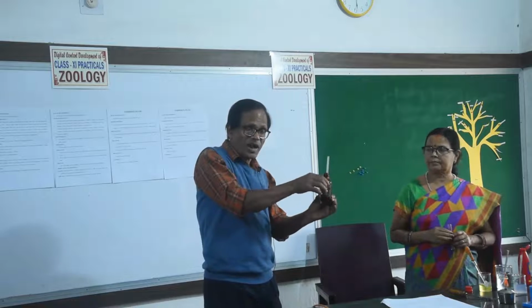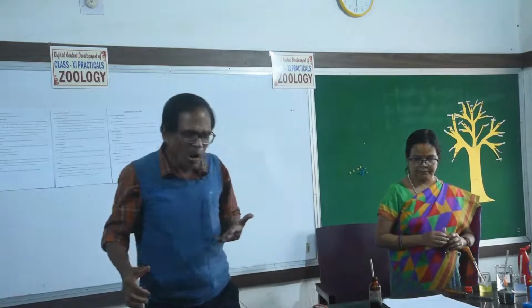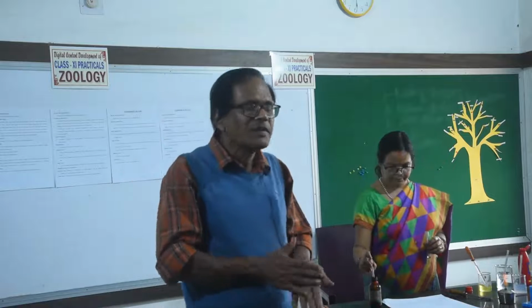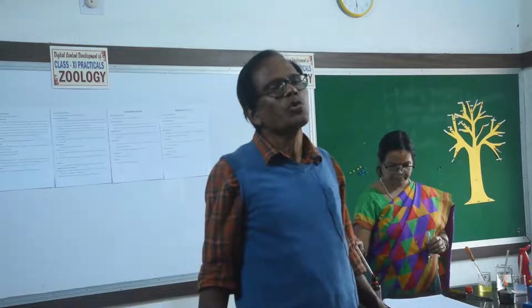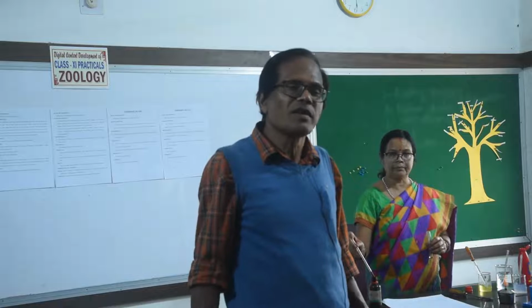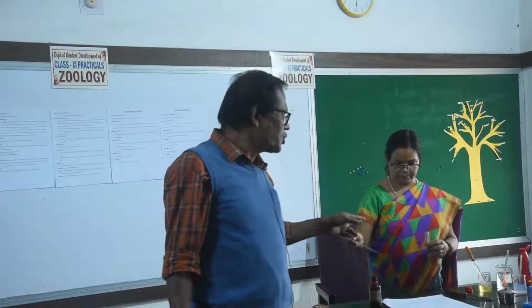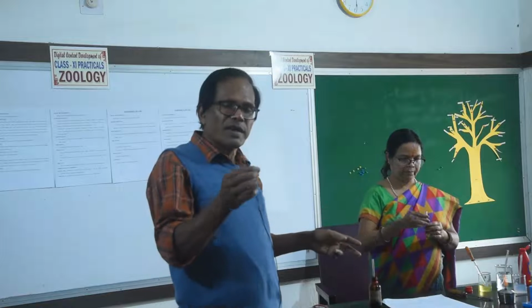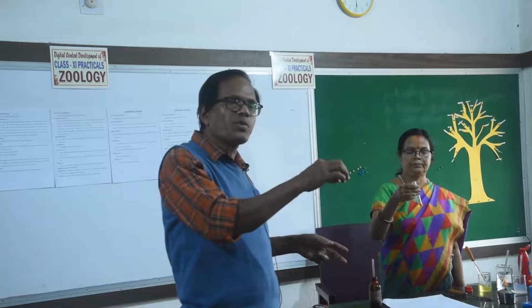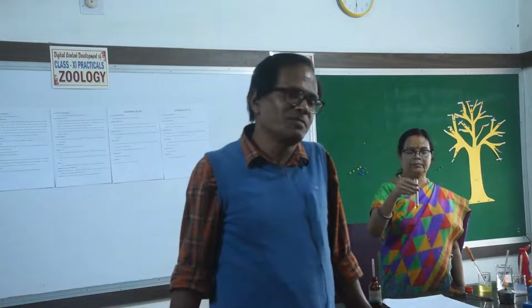I will give you 2 options for its use. Sudan powder is commercially available. Sudan stain solution is also commercially available. And it's your choice what you will prefer to use. If Sudan powder is used, a few crystals of the Sudan powder are dropped onto the test tube containing the coconut oil.